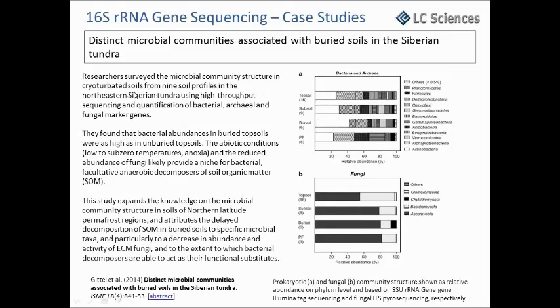They want to dig out the microbiome community structure in this soil, including the topsoil and also the buried soil. The interesting finding is that in the topsoil, they see a lot of fungi species.